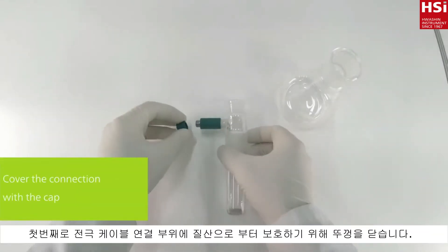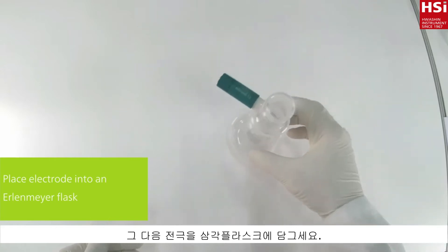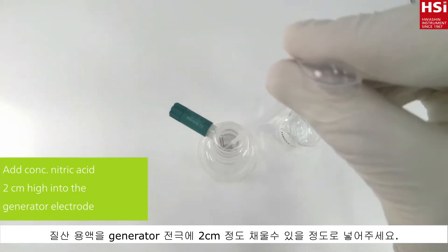As a first step, close the protection cap to prevent corrosion by nitric acid. Place the generator electrode into an Erlenmeyer flask. Add concentrated nitric acid two centimeters high into the generator electrode.